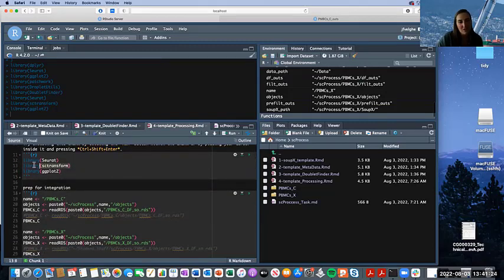SC-transform, it's important to note that SC-transform is different than if you go through Seurat and follow their online vignettes. You're going to go through a different step of processes here, whereas SC-transform actually kind of replaces the normalization, scale, and transform data functions. On Seurat, they do talk about using SC-transform, and there is a vignette for how to use SC-transform on Seurat objects, and it works a little bit better.